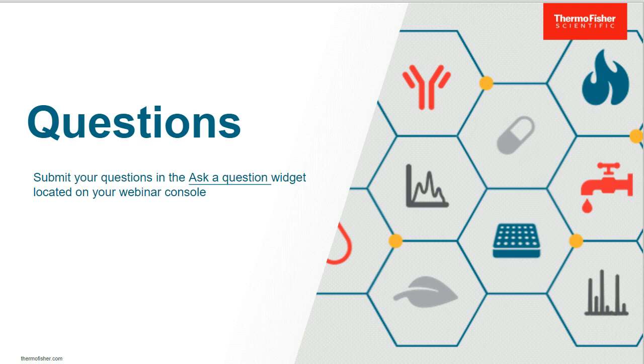Yes. Okay, great. So thank you for the questions. The data points per peak here, as Spectronaut gives them as an output, was 3 data points per peak, which is below what we usually have, but obviously the quantities were still very well determined for all the different runs. So I guess that's working quite nicely in the newer versions of Spectronaut now.